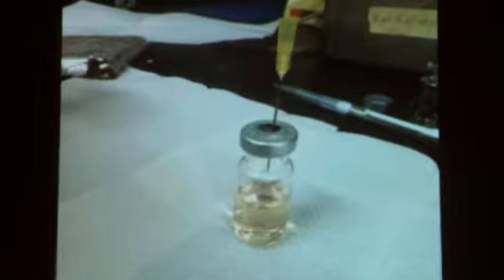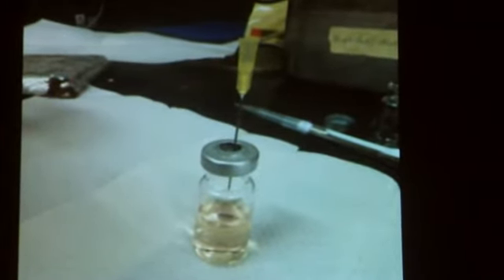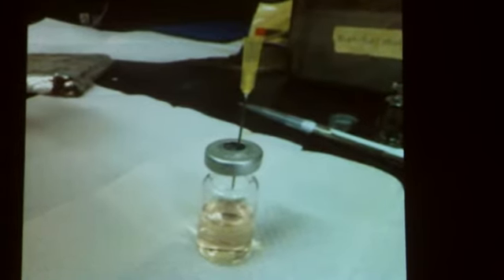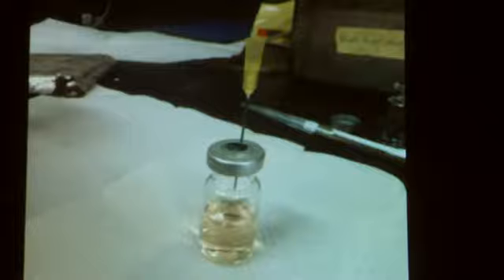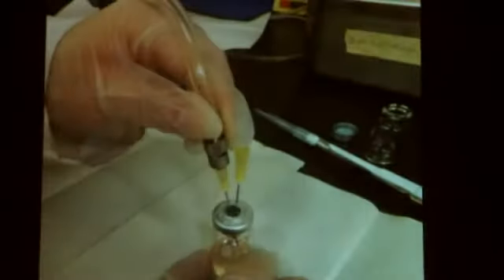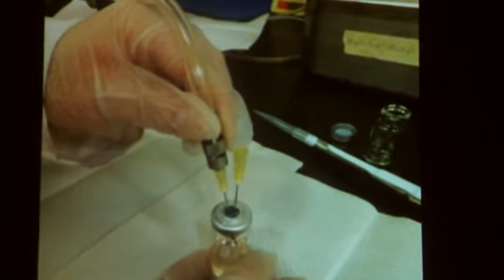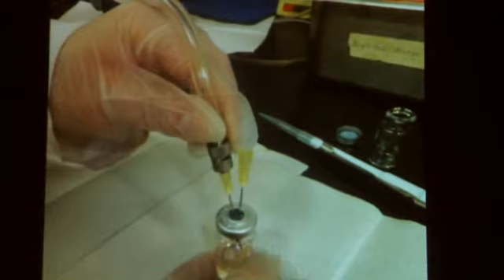Okay, so also before injecting the titanium-3 citrate, we set up the nitrogen gas tubes just as they were with the actual titanium citrate. So we first insert the tube for the air to escape, and then we insert the tube with the nitrogen gas. And this part we also found that it's easier because we can't really clamp the vials because they're delicate and they're really small.